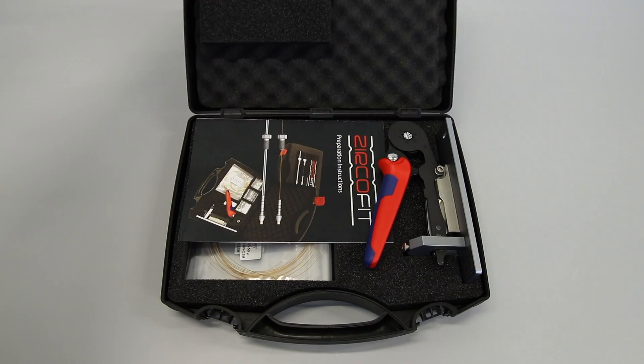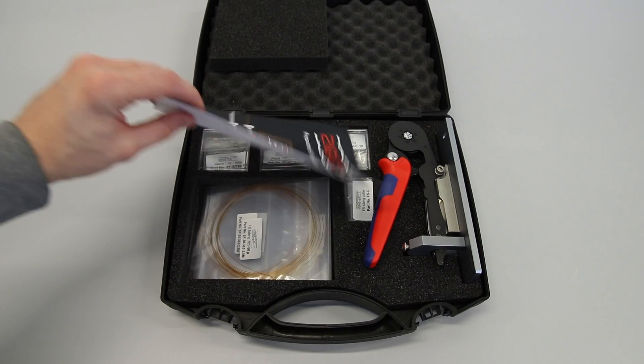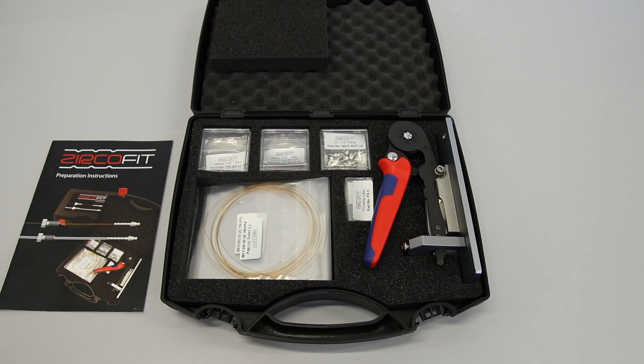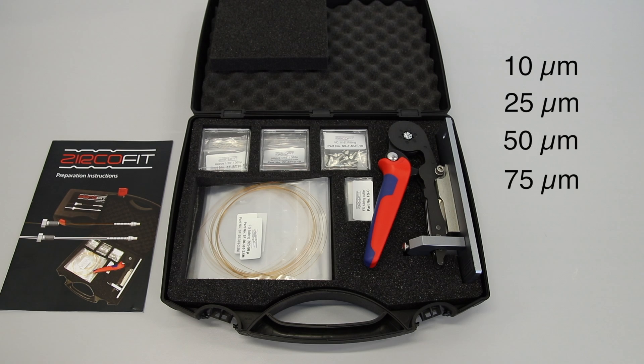The ZercoFit Starter Kit contains all necessary tools and consumables to produce 5 capillaries with protective tubing and 5 without. It also contains fused silica of 10, 25, 50 and 75 micrometers ID.